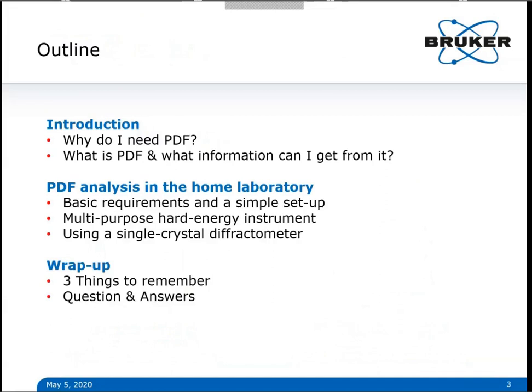So this is our plan for today. We'll start with an introduction on the pair distribution technique, but we will be assuming a little bit of basic background on XRD already. So we hope that this is true. Most of you actually signed that they have experience with powder diffraction, so it shouldn't be too complicated. And after our introduction, we will take a look at different instrument configurations and how they can be used. We will be using three case studies for that. And at the end, we'll wrap up and we'll have time for questions and answers.